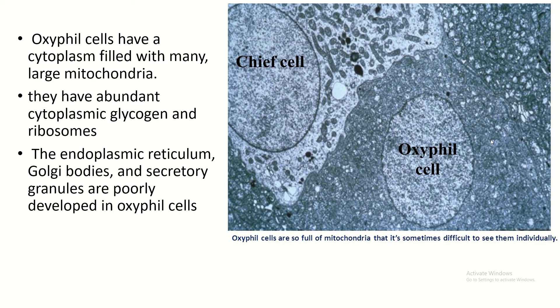This is the oxyphil cell. The cytoplasm of the oxyphil cell is filled by many large mitochondria, and in between the mitochondria, cytoplasmic glycogen, ribosomes, endoplasmic reticulum, Golgi body, and secretory granules are present.